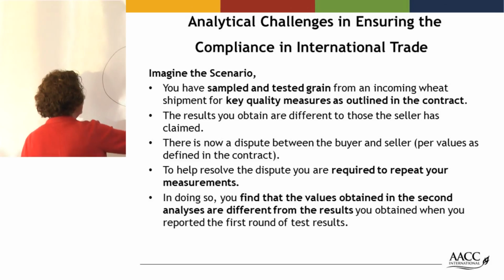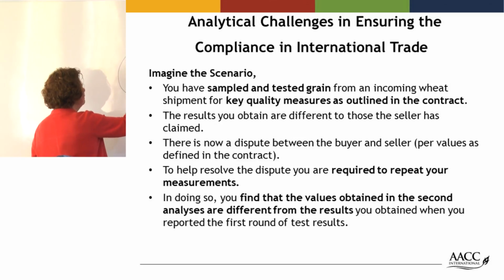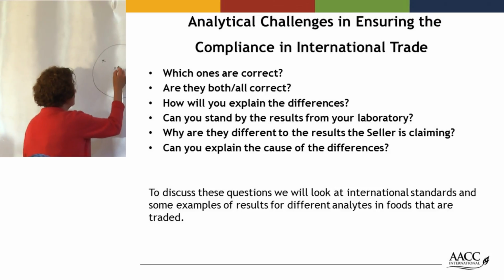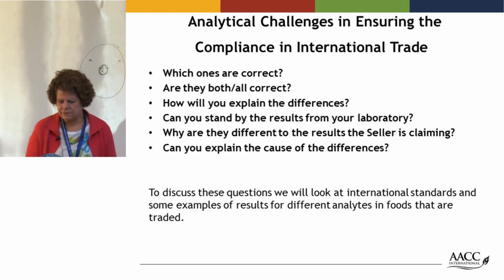Here we go. We're here, we're here, we're here. Is this 12? Is this 14? Is this 13? This is the correct, or the best estimate of the correct value, with some variability around it, but which one's right? How are you going to resolve it?